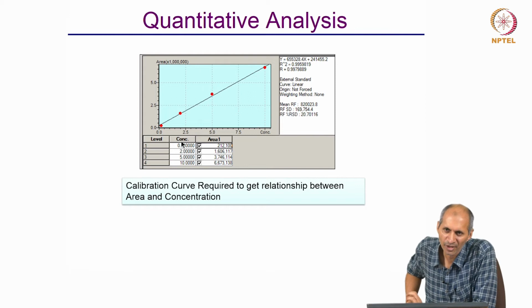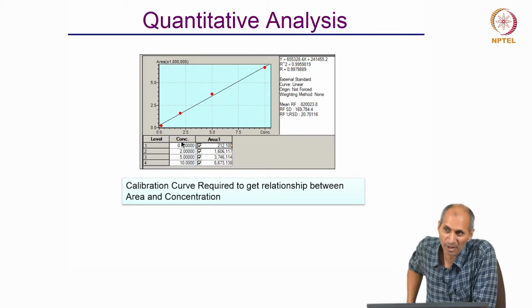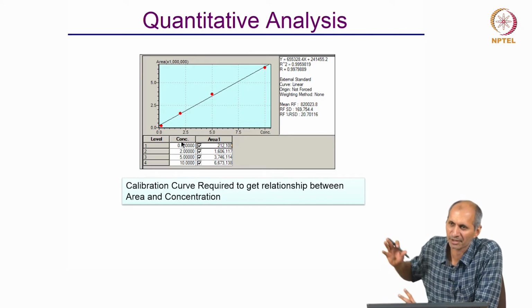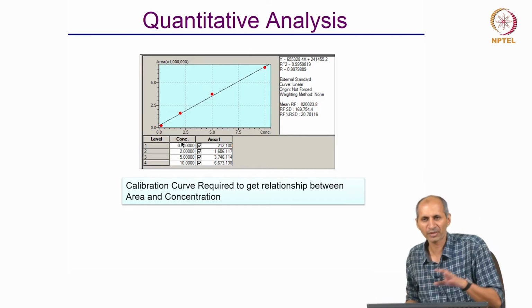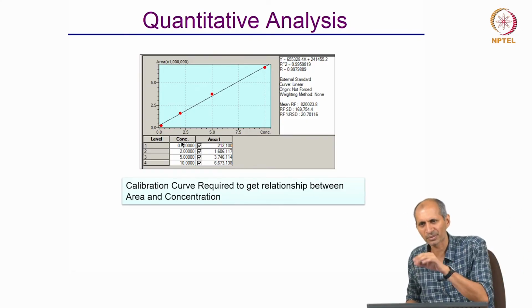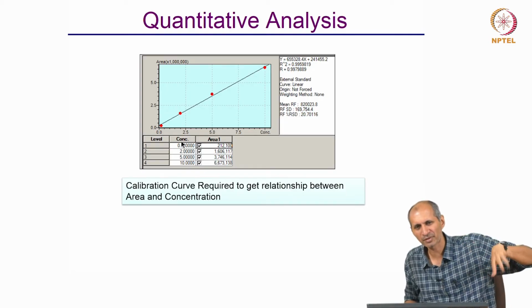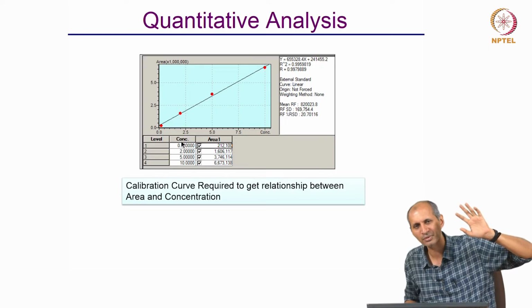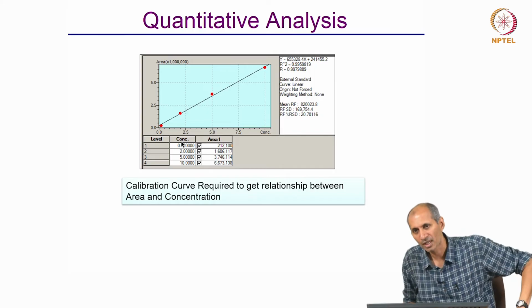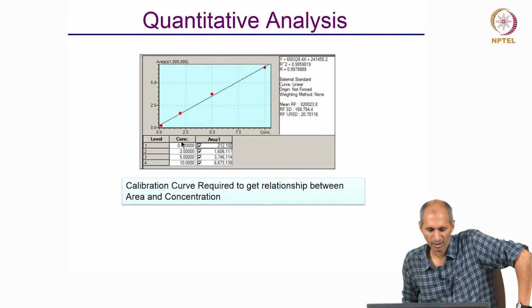So, as long as it is consistent, how do you know what is happening in the system? You are not getting a mass unit, you are not even measuring mass, you are measuring voltage or something, right. So, that is why we sometimes do concentration calibration, because we do not know how much mass, people do not worry about that. Also, concentration is used directly because the volume injected is the same most of the time, it is fixed. If you inject different volumes, then you have a problem. Concentration and mass are the same, there is no change.